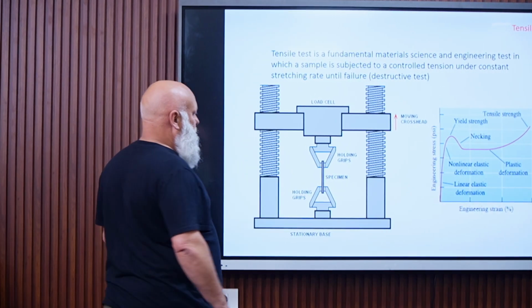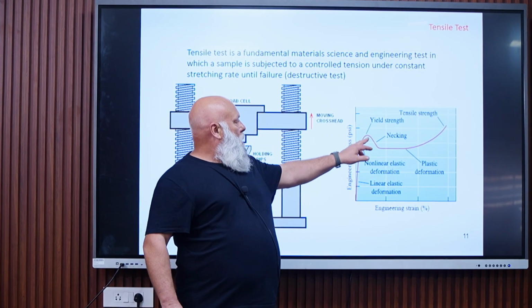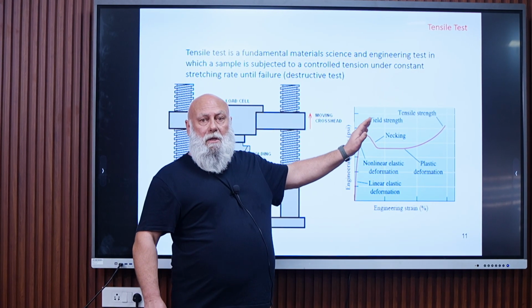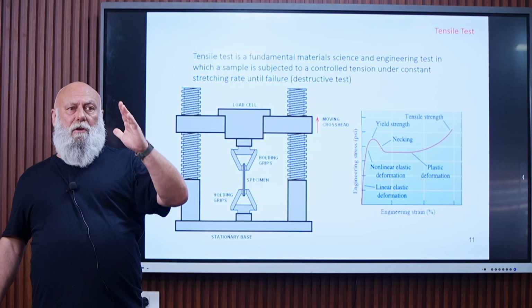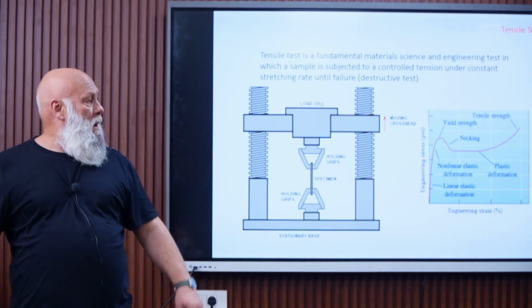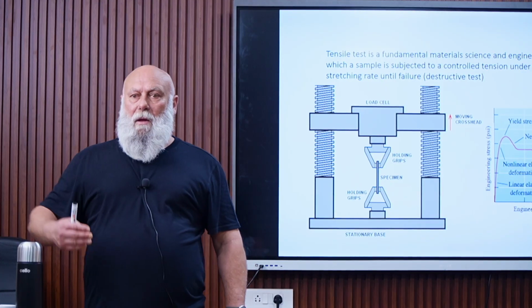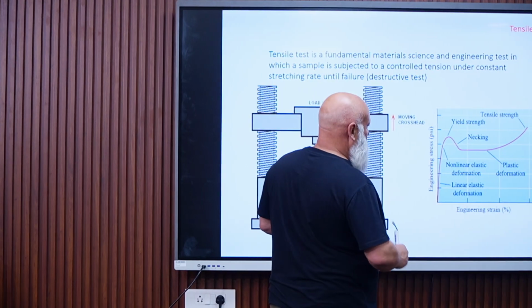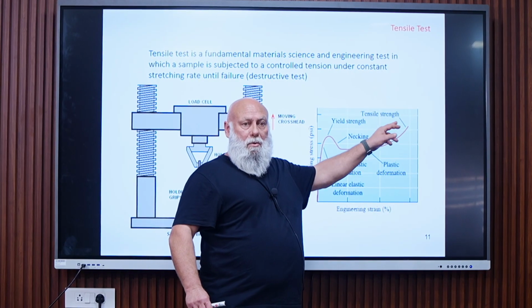So it means that from this curve, we can determine the initial slope, the modulus, of course, the yield strength, which is important because from this deformation, we don't have anymore, so at the beginning it's an elastic deformation, then after the loss of linearity, it's a viscoelastic deformation, and from the yield point, we have a viscoplastic deformation. So plastic deformation means that we have irreversibility of the deformation. And of course, we can determine the strain at break and the stress at break.